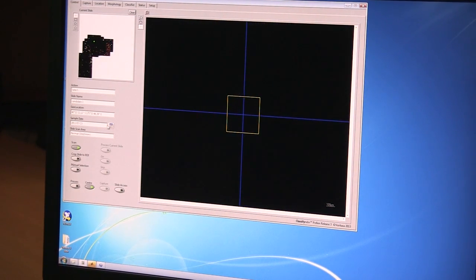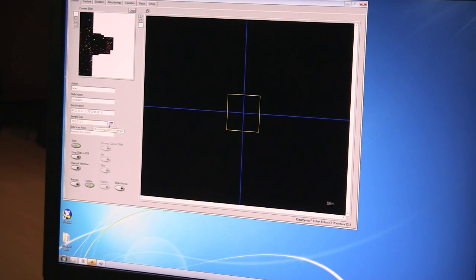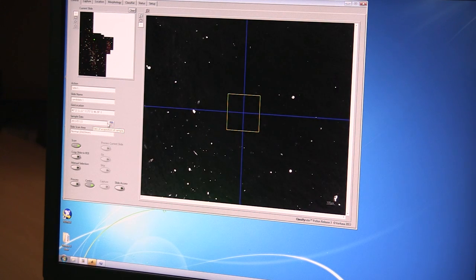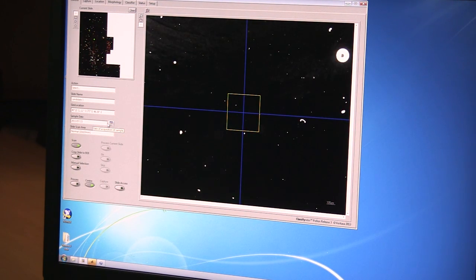And then once the information's in we send the classifier to scan the slide at low resolution and find the location of all the objects of interest on the slide.